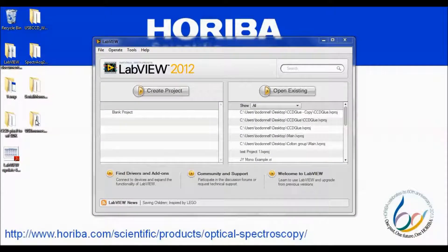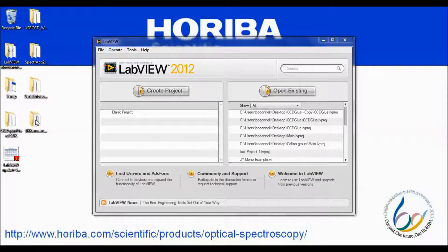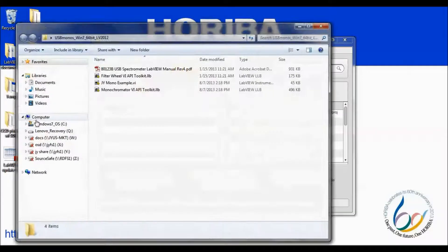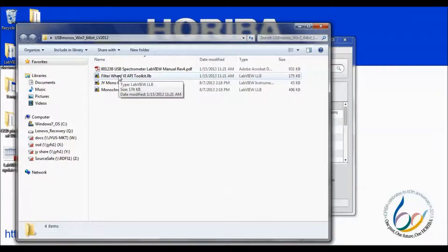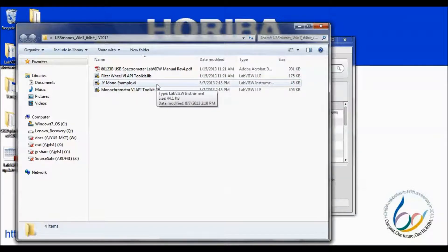I am going to begin with spectrometers controlled through USB. This would include the IHR320 and IHR550 as well as the M-Series II spectrometers. If we look in the containing folder, we see a variety of files. First is the manual in PDF form — a great place to start to familiarize yourself with the VIs included in the various libraries. Next, we have the Filter Wheel Toolkit. If your spectrometer has an internal filter wheel, it can be controlled using this set of VIs. Next, we have a VI entitled JY Mono Example. This is a compiled VI that serves as a good starting point for developing your own code.